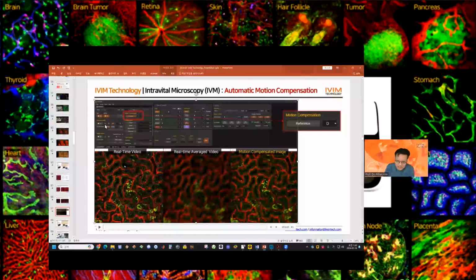But in that case, the number of pixels will ultimately limit our imaging resolution. In our microscope, we can increase the pixel number to 2048. So if we use a lower magnification objective lens, then the pixel size will ultimately limit the imaging resolution.